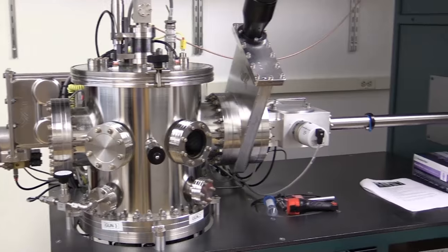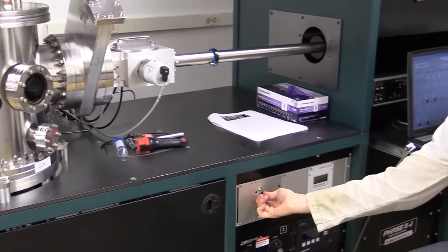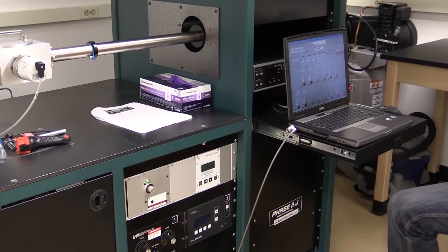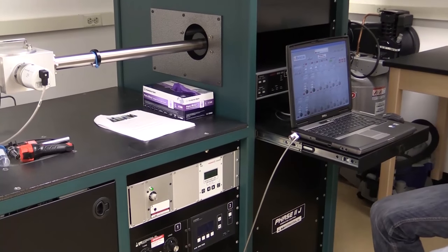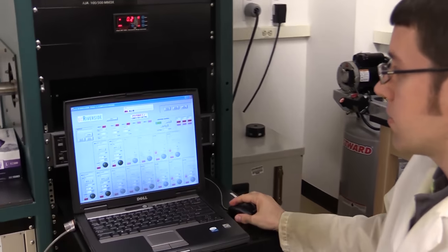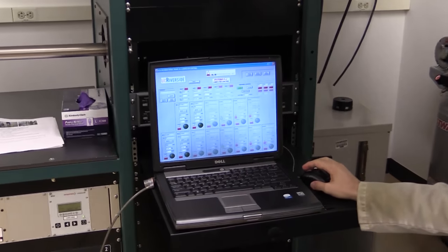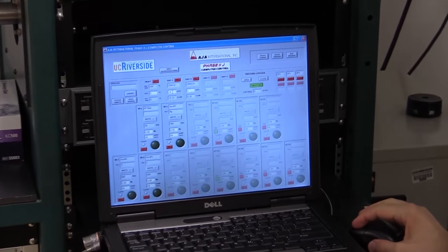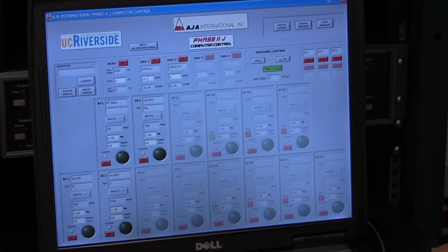I'll turn on substrate rotation. You see this green LED comes on. Now I'll go over to the laptop. I'm going to throttle the VAT valve. I'm going to start the argon flow. Here I'm using 10 SCCM, which means standard cubic centimeters per minute.